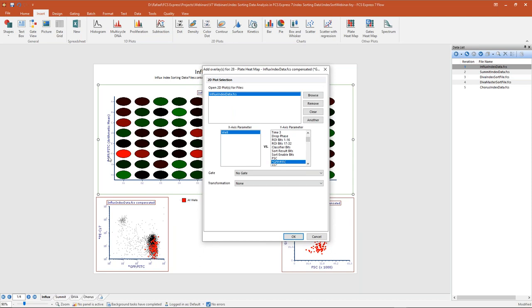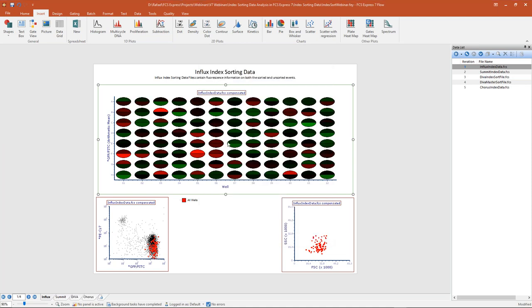Next I need to select my y-axis parameter to add to the heat map. For this overlay we're currently looking at the GFP or FITC parameter, so I'm going to change the next overlay to PE-Cy7 and click OK. Now we can see the heat map has been updated with an upper slice and a lower slice for each well, each slice representing a different parameter and statistic.